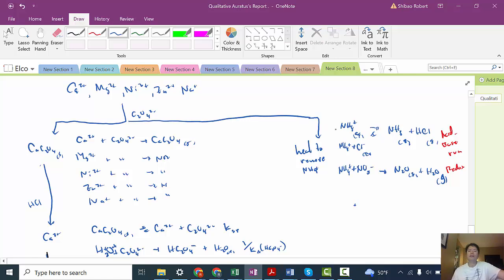Oops, this was supposed to be with plus the chloride here. There. All right, so now we could add our sodium hydroxide, and we don't waste a lot of sodium hydroxide neutralizing ammonium, which is an acid. So the sodium hydroxide, will it react with magnesium? Yes.